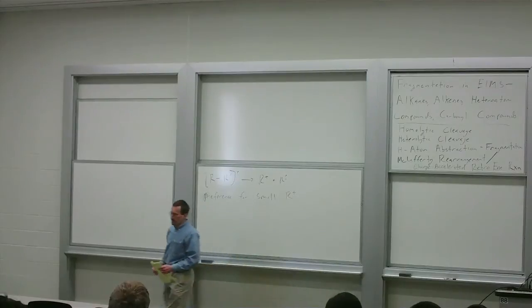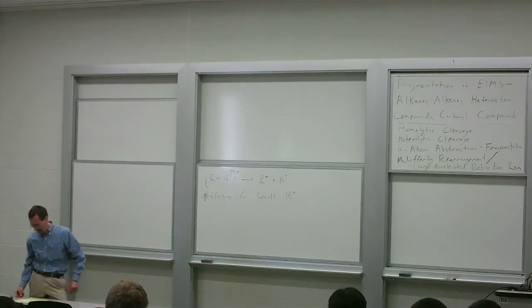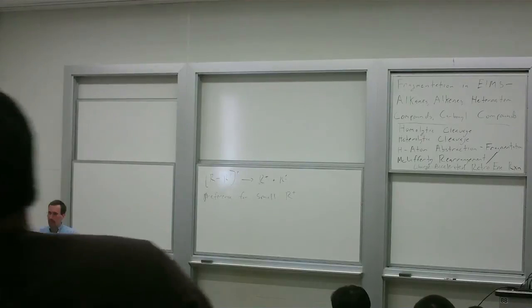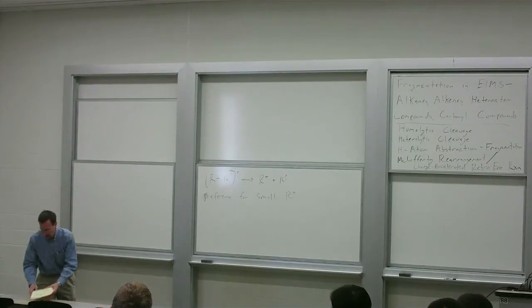And that's often because of fragmentation and subsequent fragmentation. So typically the biggest peak you'll see will be a propyl cation, C3H7+, at 43, or perhaps a butyl, C4H9+, at 57. And in part, this is because even if you have a big molecule, the carbocation can then fragment again, spinning out alkenes and blowing off energy to form smaller fragments.